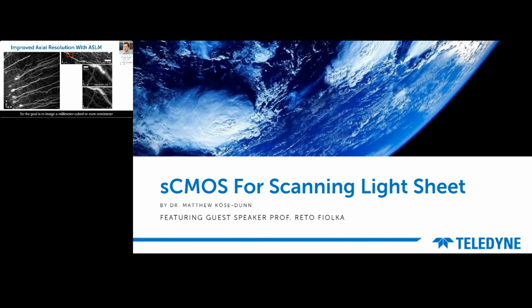So the goal is to image millimeter cubed or even centimeter tissue volumes. It can be brain research, but we are also involved in cancer research, for example, to map metastatic sites in organs where cancer cells metastasize, and, for example, image at subcellular resolution what is the morphology of these cancer cells, what are certain pathways that may be activated, and the distribution of signaling proteins.